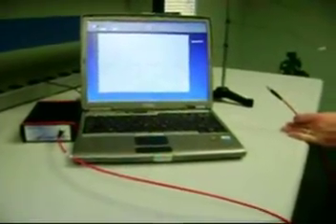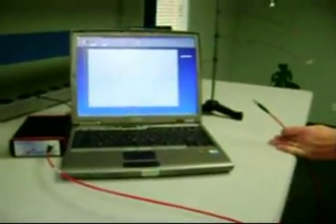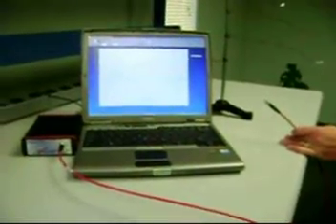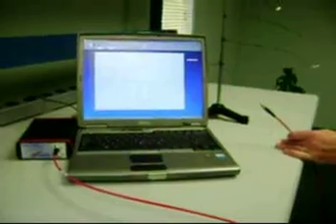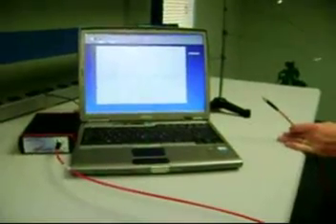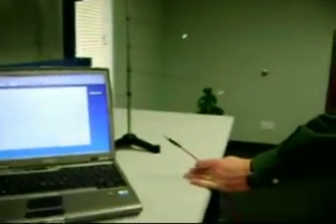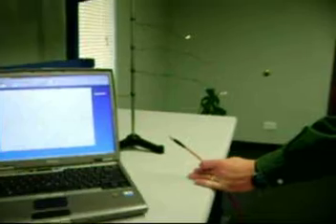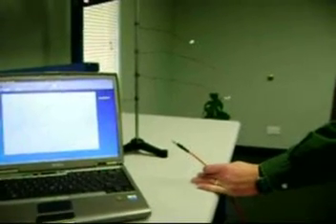We'll be looking at two different techniques for emission line measurement. First will be measurement of overhead light. Fluorescent lighting has very clear mercury peaks we'll be viewing.